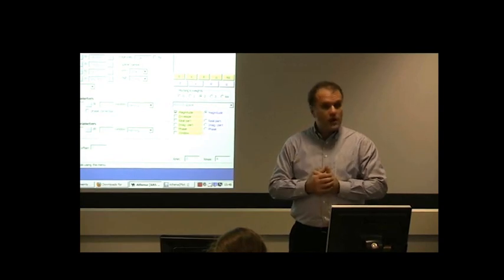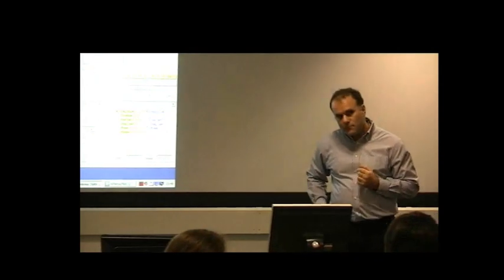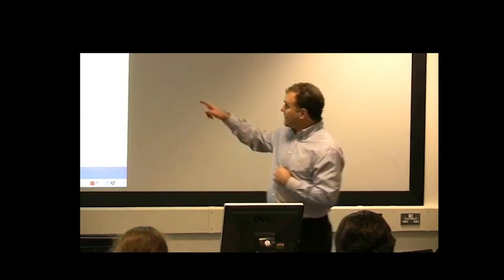Okay. Sir? Generally, is the Kweight for the background removal the same as the Kweight for processing of the data? Doesn't have to be. If you want it to be, it can. But as you're going to find out tomorrow, that's the only Kweight in the processing.